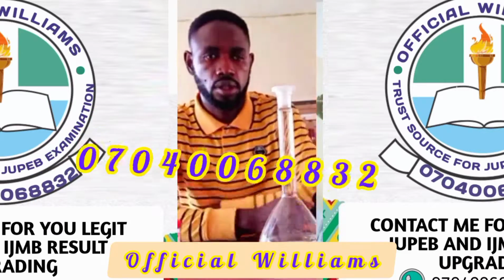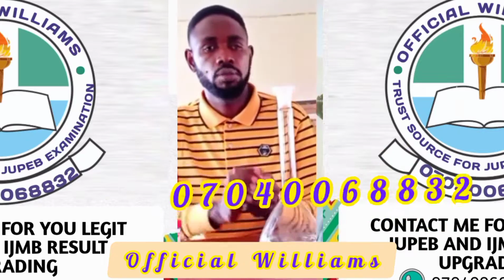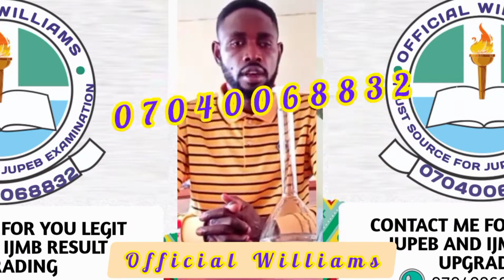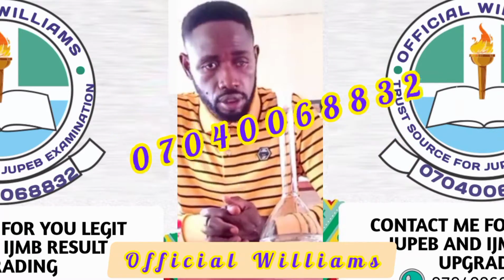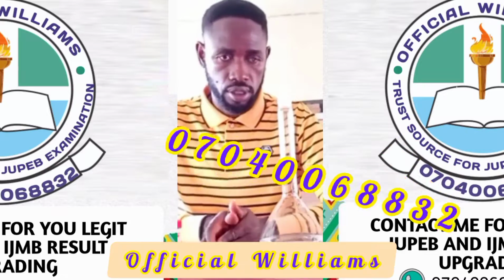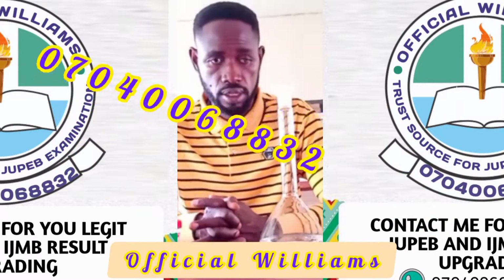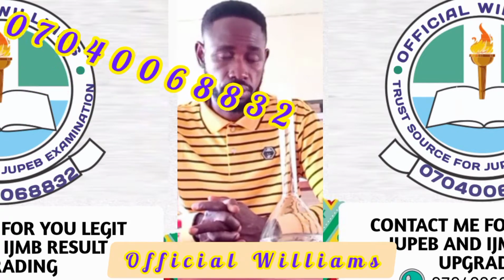Okay, these are the specifications, and this video is strictly for the chemistry teachers, to guide them on how to prepare these two standard solutions according to specification. First, we have to list the materials required for this preparation. Please follow them religiously. Don't skip any, because if you make a mistake in the preparation, you are failing your students indirectly, and it's not good for a good teacher to be the reason why his or her students are failing.